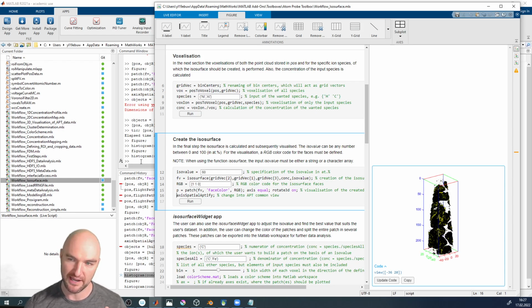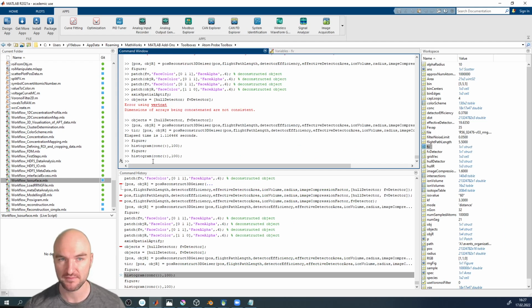And of course, you're going to have certain shapes driving your reconstruction. The simplest one we're going to look at tomorrow is just having a grain boundary. If you just have a grain boundary, you can just say, okay, maybe we'll want that to be flat. If I know it's flat, maybe it's bound, maybe it's curved, maybe I know what the curvature is. Could be any information I have.